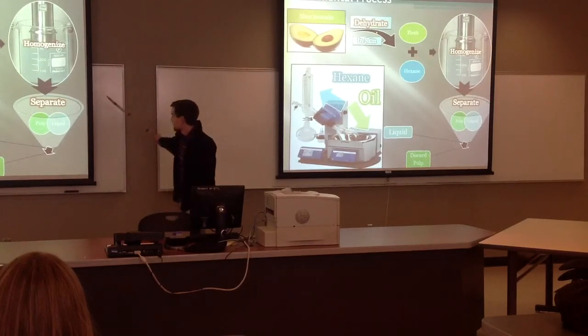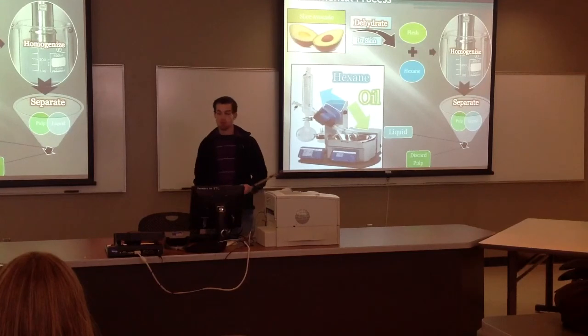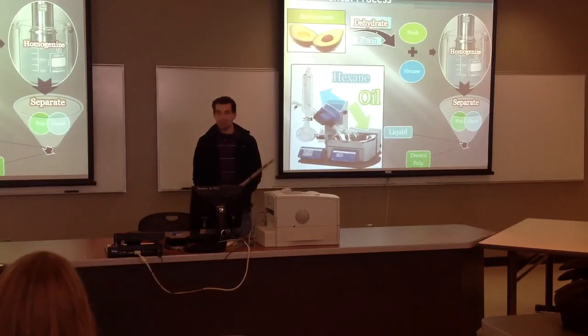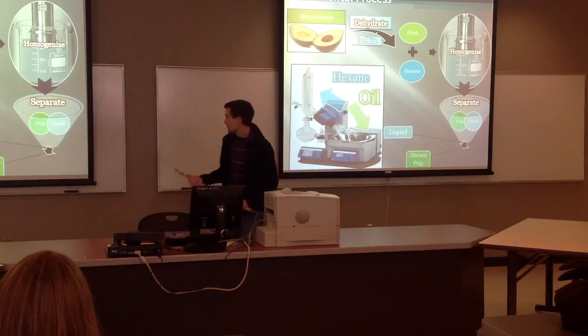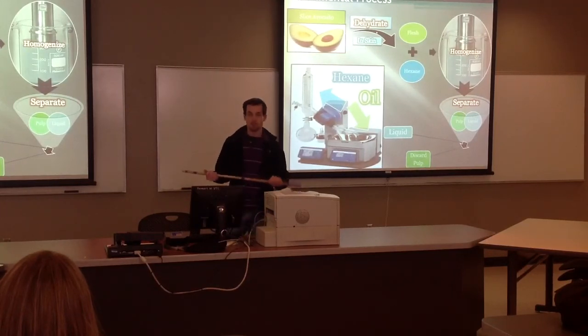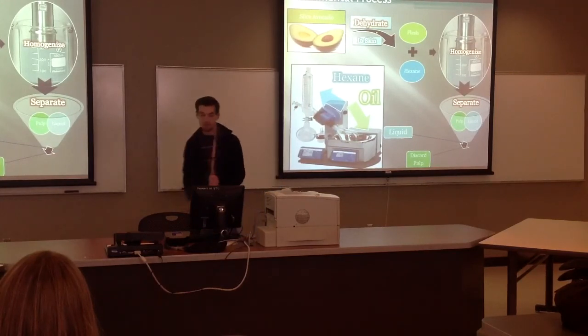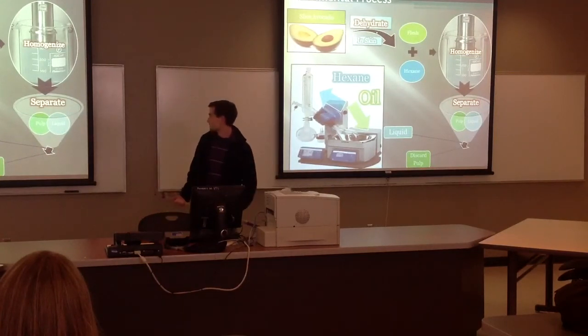So once we've homogenized and blended it, we separate it. And this is one of the problems with a lot of people's procedures: there are sieve trays, coffee filters, sometimes just decanting it out. In most of these procedures, we lost a lot of this liquid that we're trying to contain, the hexane oil mixture. So what we did to counteract that was we tried different methods.